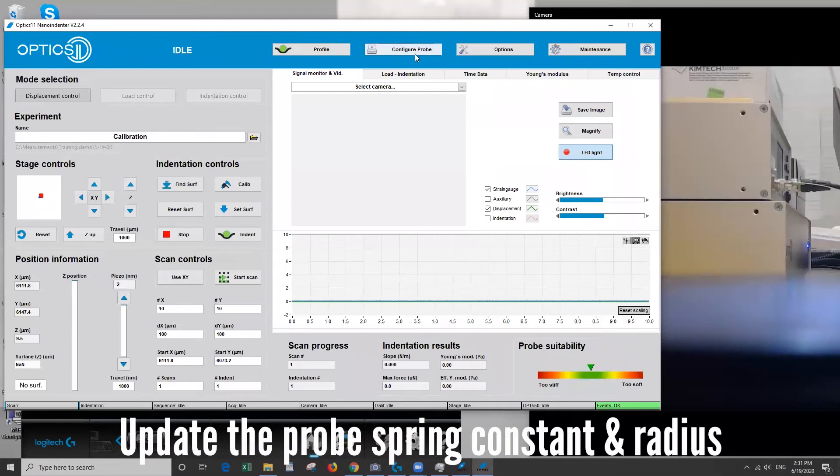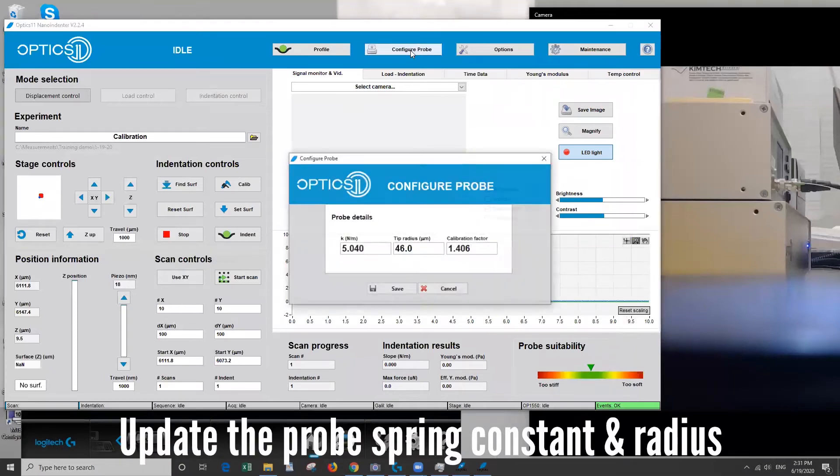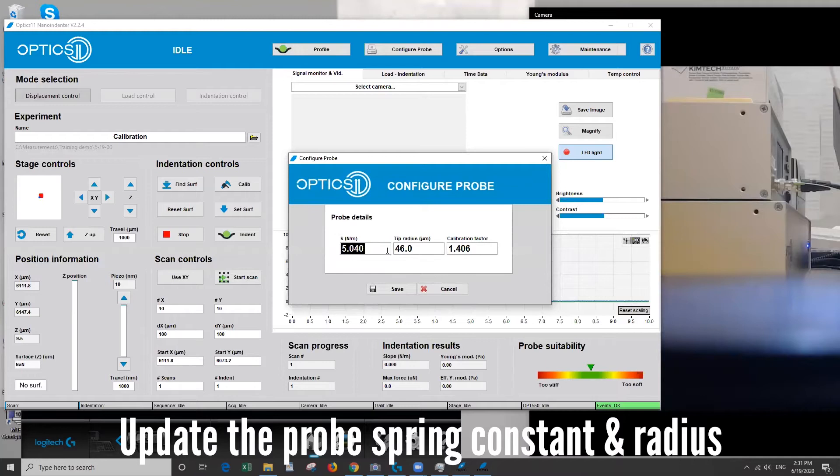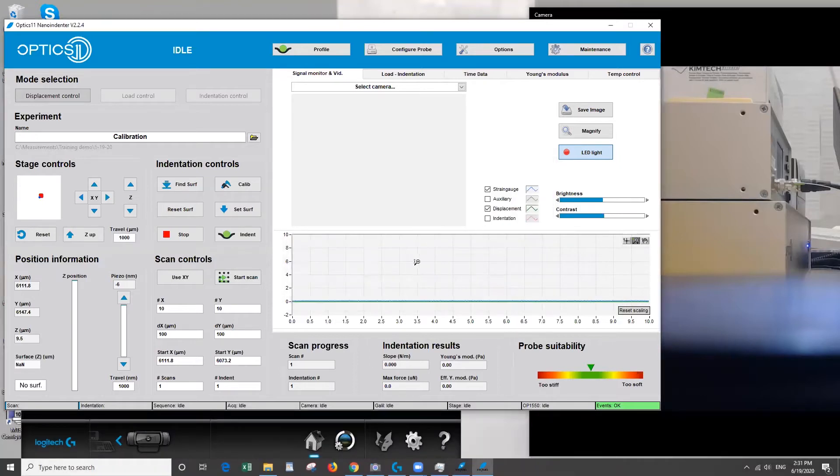Then we're going to configure the probe. So this depends on whichever type of probe you're using. So on the front of the box of the tip that you have it will give you a specific spring constant as well as a specific tip radius. So input those here and then save.